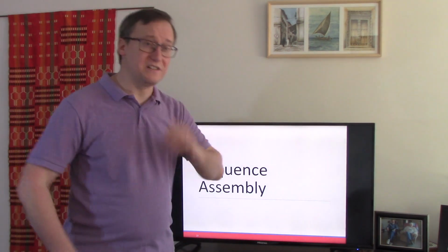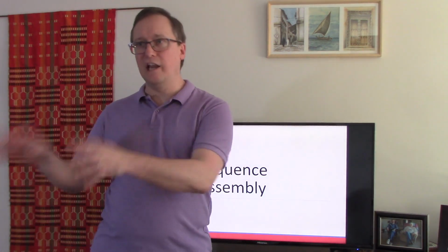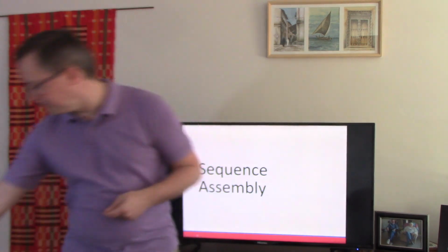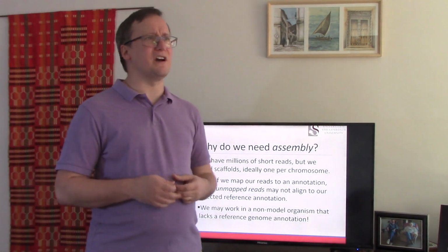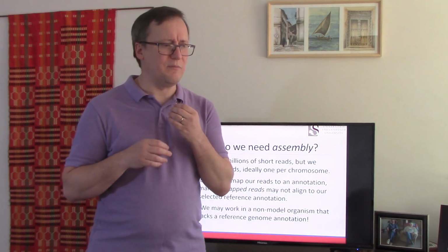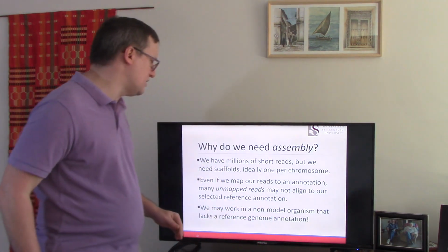Okay, which brings us away from the questions of sequence mapping, where we aligned reads to a known reference database for the entire genome, to the sort of thing that people who work in non-model organisms do more frequently, which is to deal with sequence assembly. So why do we need assembly? I've already talked about how much more efficient and lower memory requirement we find sequence mapping to be. So why do we have to introduce assembly at all?